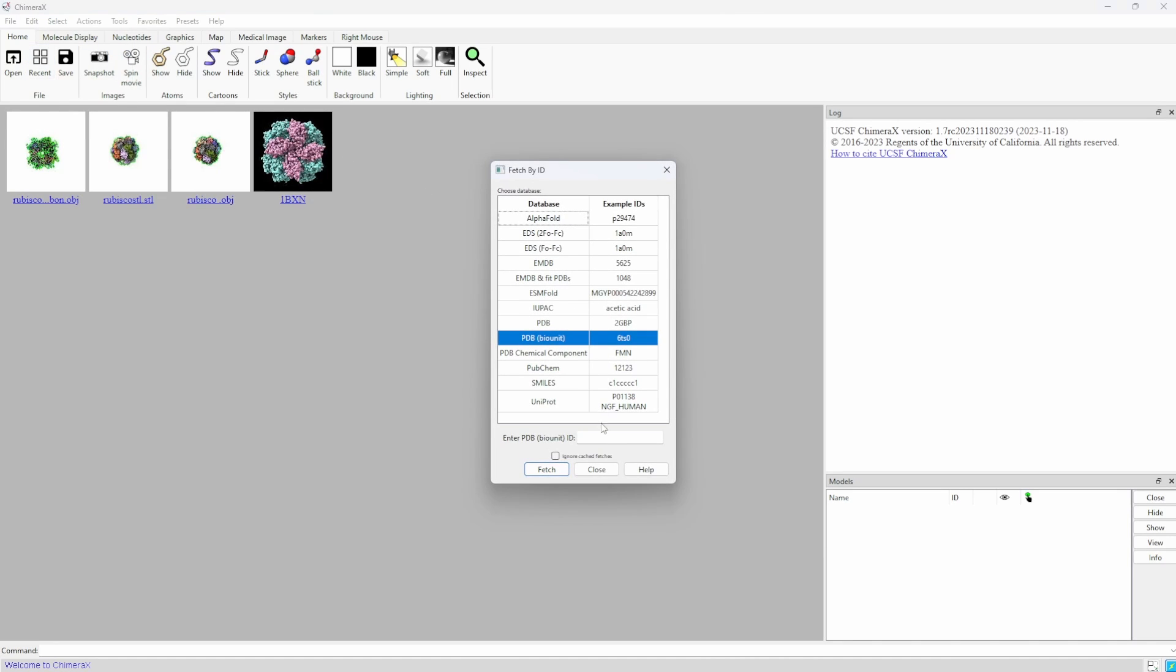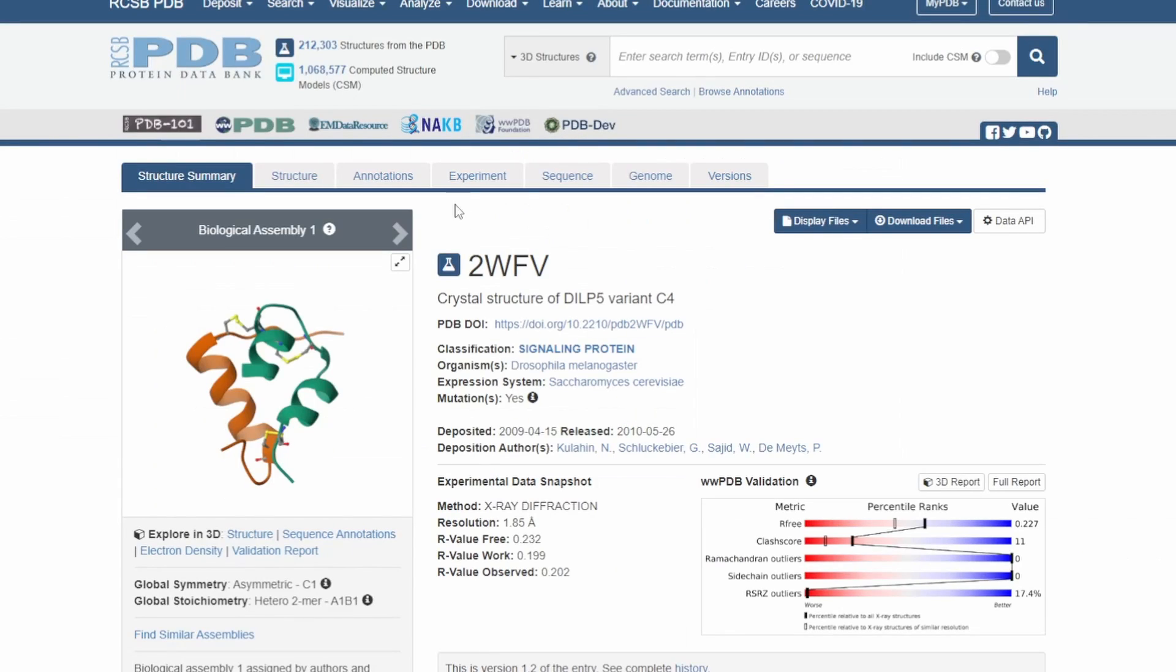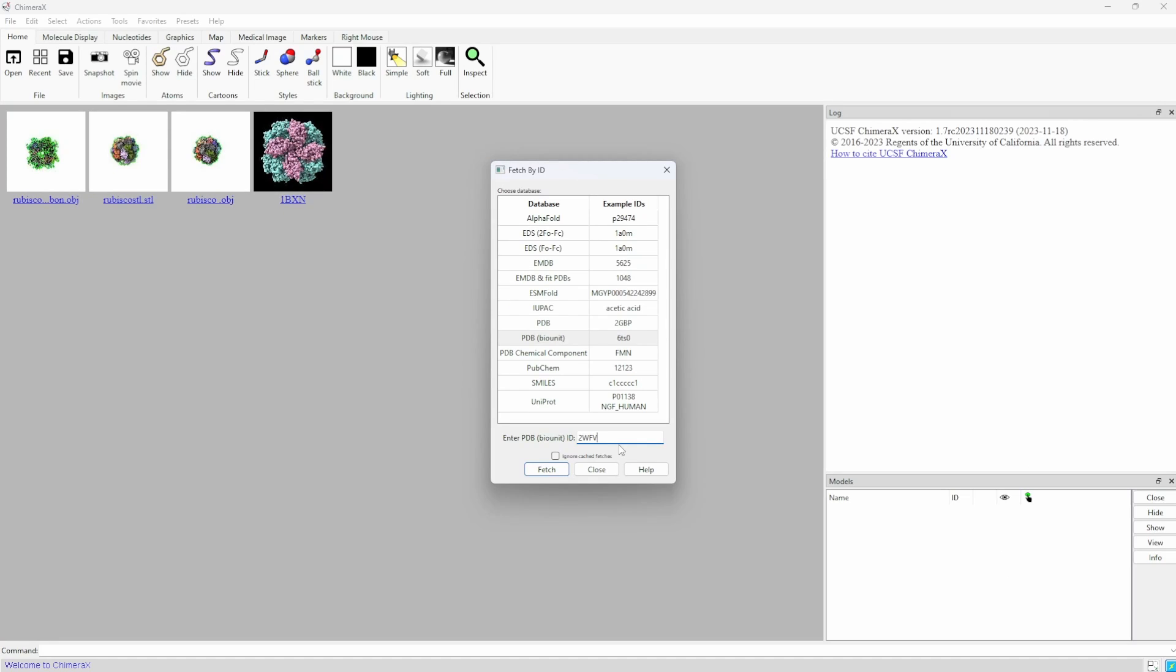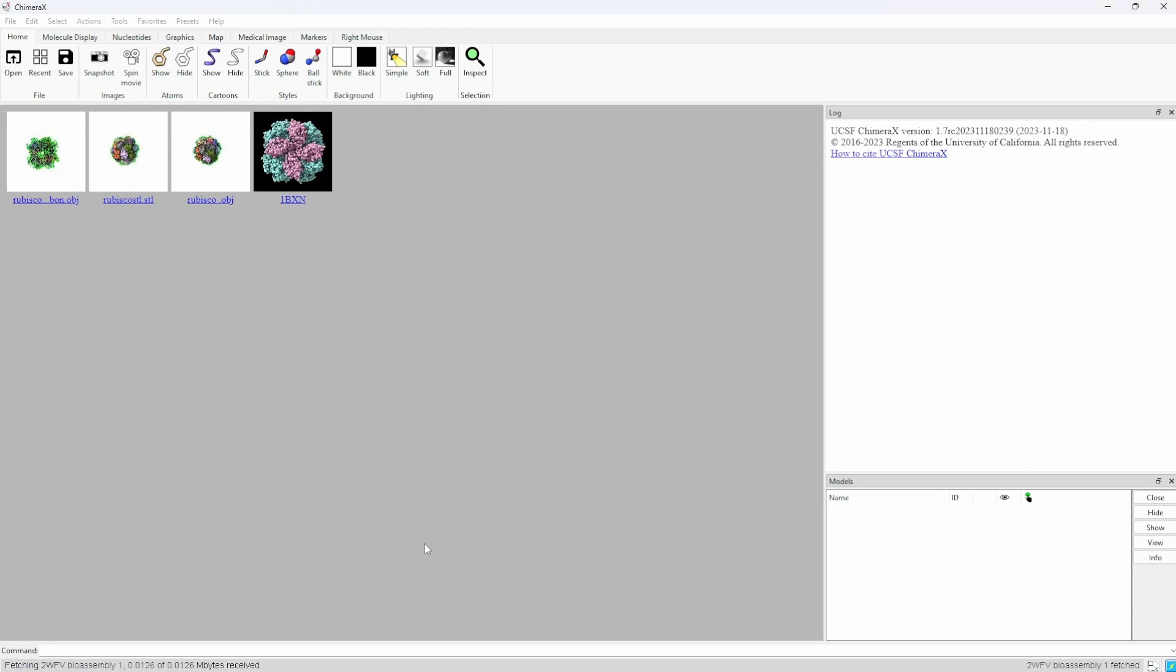ChimeraX is already a very cool program in itself. Just go to File, Fetch by ID, and I will reuse the PDB code for insulin, and there it is.